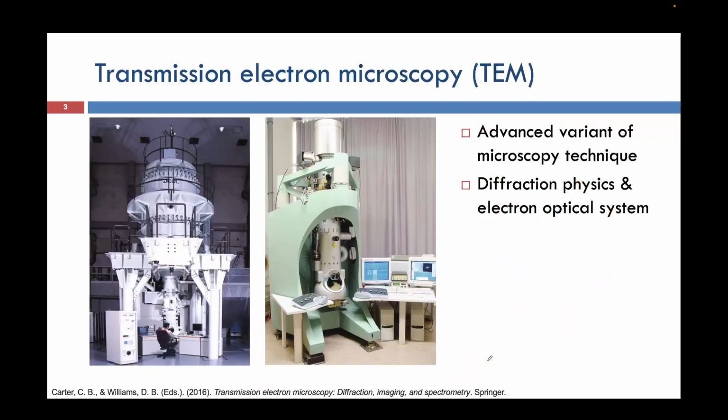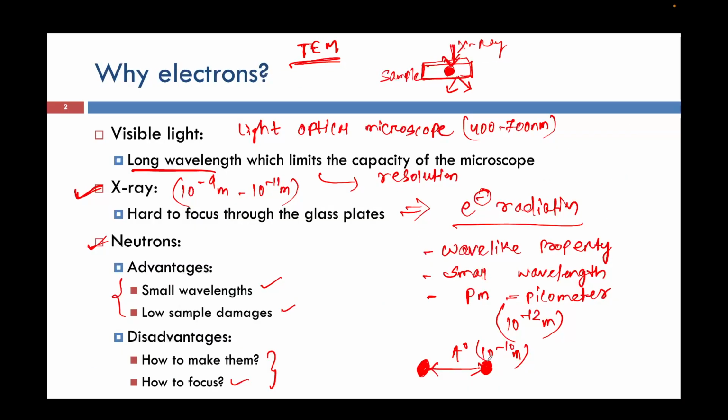Now, if you remember, in the first class of materials characterization I told three criteria for diffraction, reflection and transmission. So what is the criteria for transmission? The criteria was, let's say one wave is coming, the wavelength is lambda, and the distance between these two objects is d.